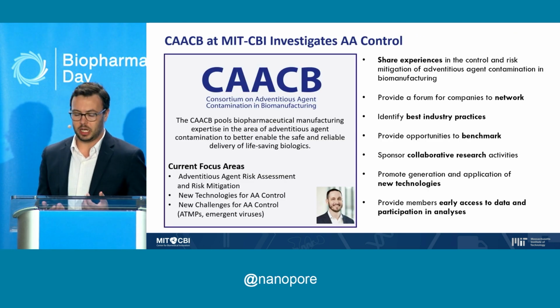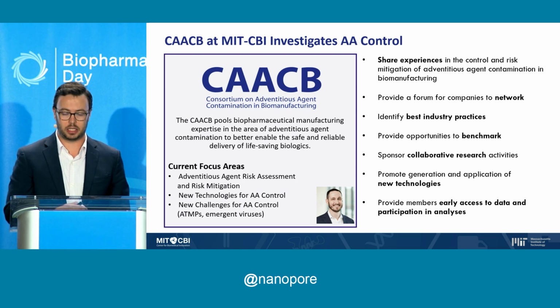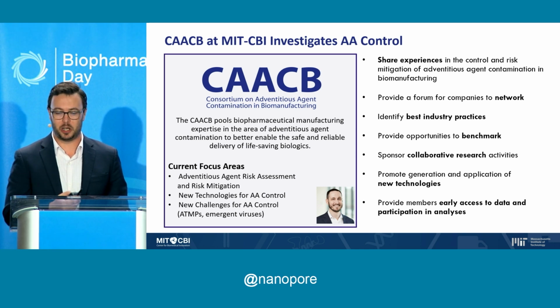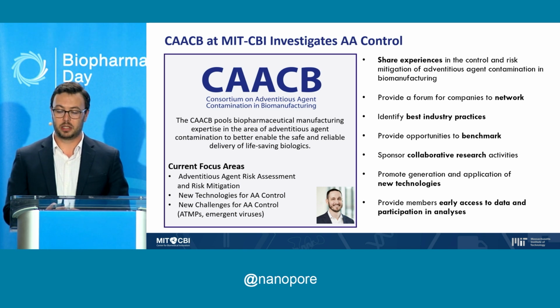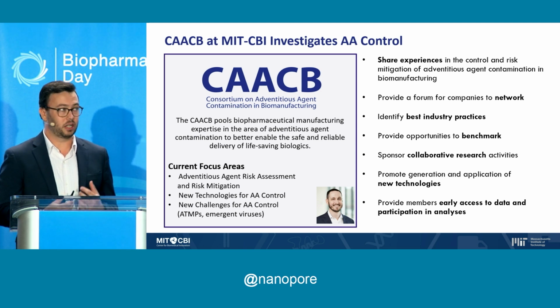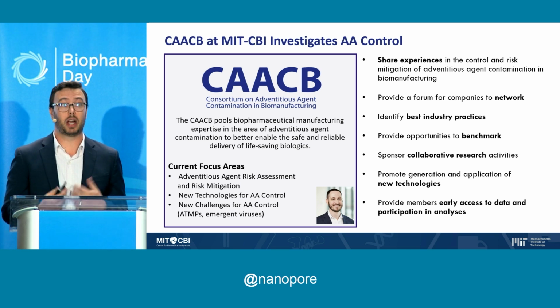And so we wanted to look at this further and understand how effective are these assays. And we did this by working with a consortium that we house at the Center for Biomedical Innovation called the CAACB, or that very long name underneath, the Consortium on Adventitious Agent Contamination Biomanufacturing. We bring together a number of different viral safety experts from a variety of companies. We work together and share best practices, publish collaborative research, and we work as a neutral third party to anonymize data collected by our members so we can better understand how well do viral safety assays work.